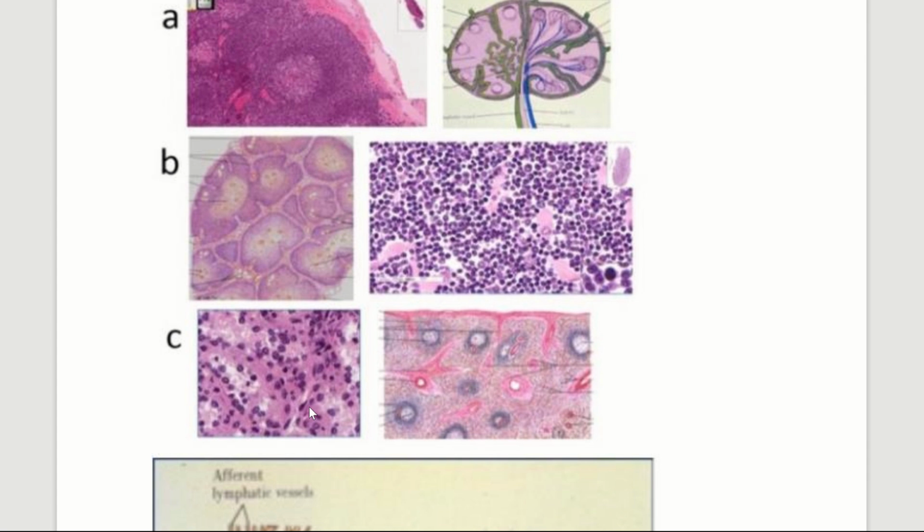And then here, so what this one is depicting, we've got a bunch of strands in here. You see these kind of dark pink looking strands with gaps and stuff like that, right? So this is characteristic of the spleen, how we've got this kind of strand-like appearance. Because remember, we had those Billroth strands with literal cells lining up on it. And then we've got these sinuses in here that the blood kind of percolates and filters through. Okay, so this is the spleen.